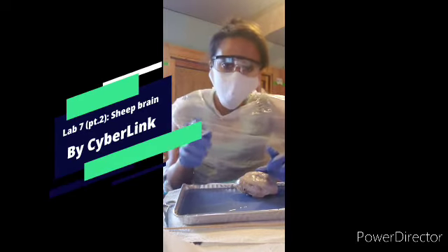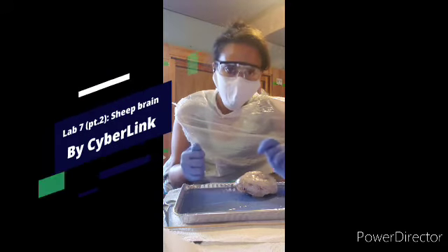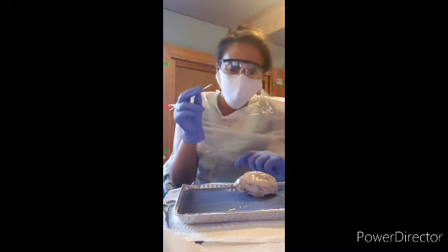Part 2 of Lab 7 is the sheep brain, as you can see here. Now, to start off, let's get started by labeling.